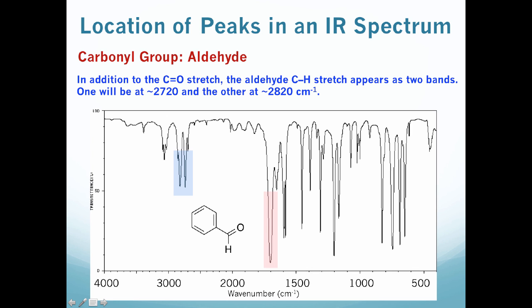You're going to see the aldehyde stretch, again, right around 1720 wave numbers. Here is benzaldehyde. Now in this case, this could be a little bit confusing because the aldehyde is in conjugation, so that causes the stretching frequency of the aldehyde to be lowered to right around 1700 wave numbers. So that could be an aldehyde in conjugation, or you might be tempted to think that it's just a ketone.